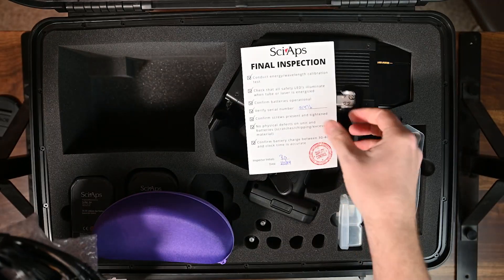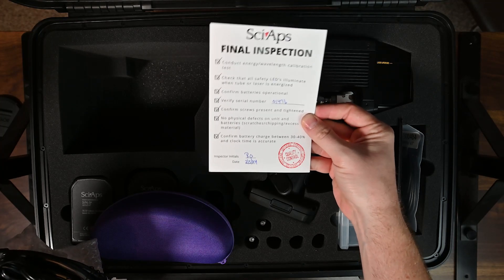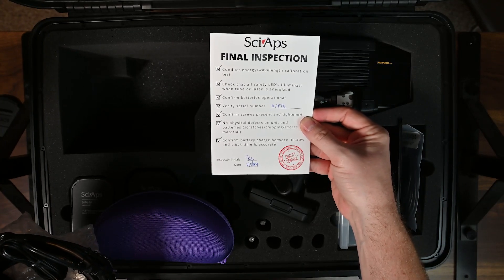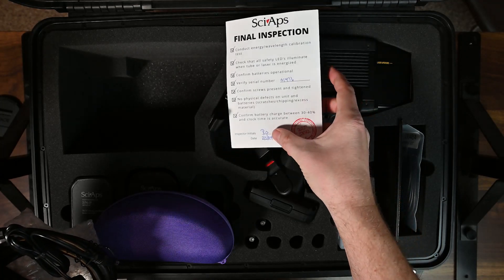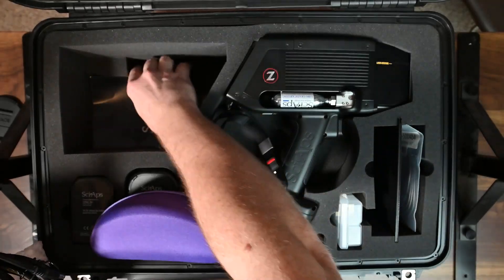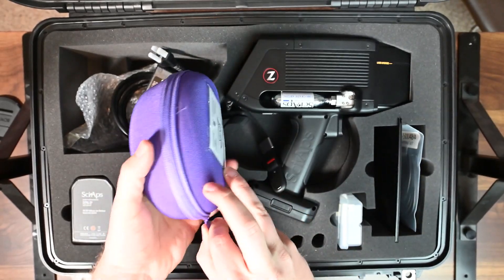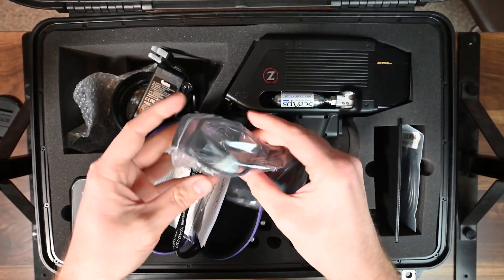There's a note at the bottom — a final inspection and quality sign-off. It's great to see that people are actually doing this. I can't tell you how many instruments I've seen in the field that have been dead on arrival, so having a quality control person who actually signed off on this is a fantastic stance on quality. I applaud SciAps for doing that.